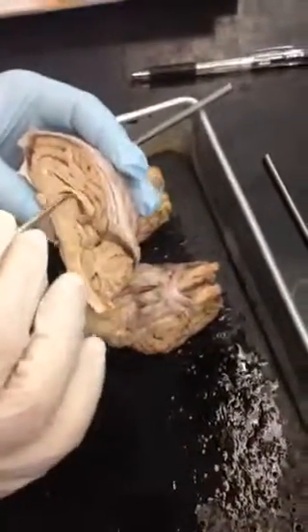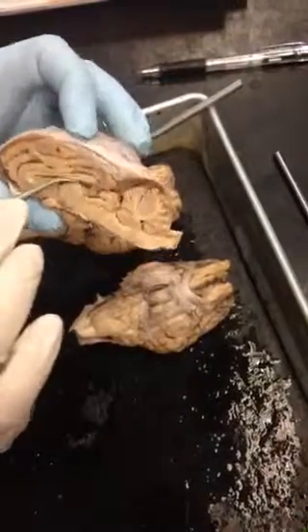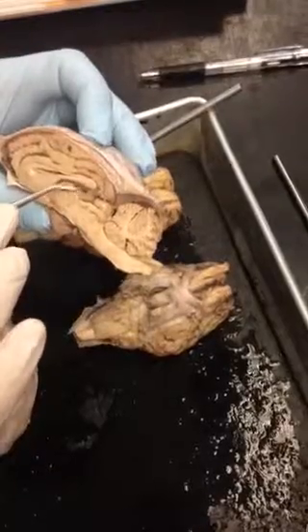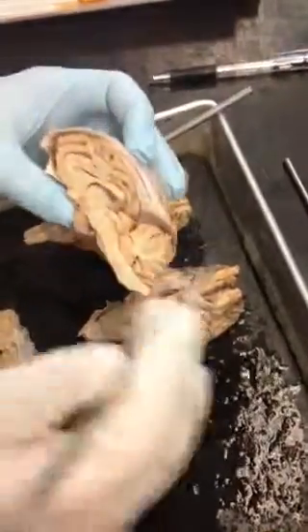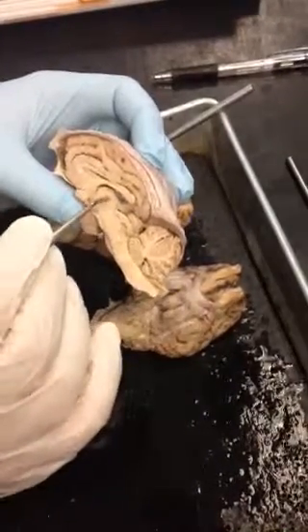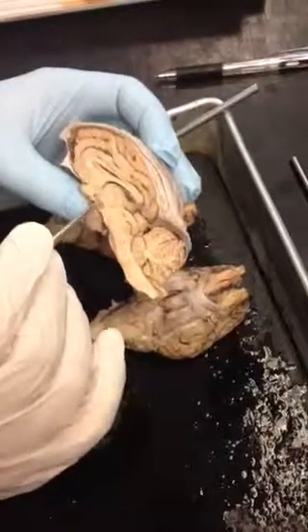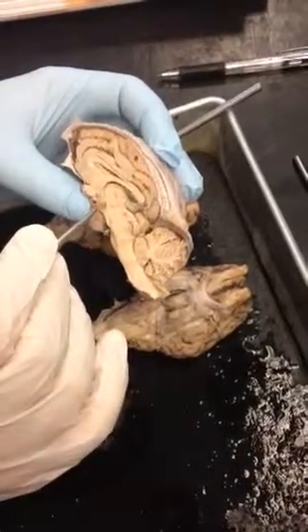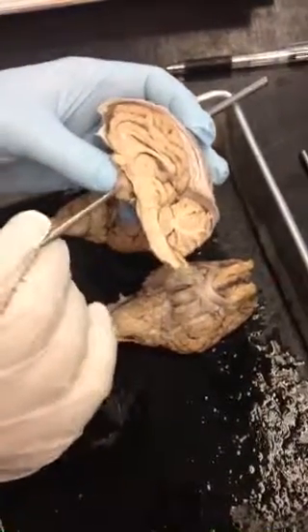Okay. So this is the third ventricle right here. There's also some choroid plexus. Remember, it's in all of the ventricles, right? So that's the third ventricle. The intermediate mass of the thalamus is right here. Directly below that would be the hypothalamus.